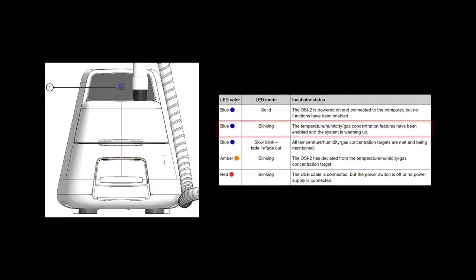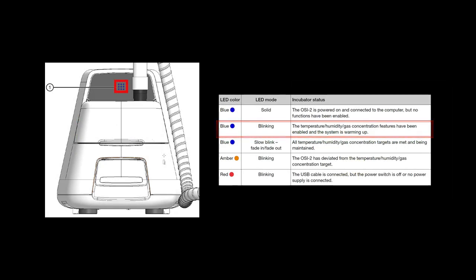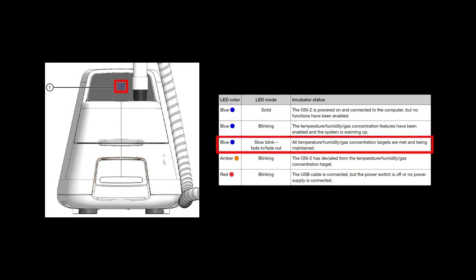A blinking blue LED on the control unit indicates that incubation features have been enabled and are being adjusted to the target values. A slow blink fade in fade out blue LED indicates that the incubation features are on target and being maintained.